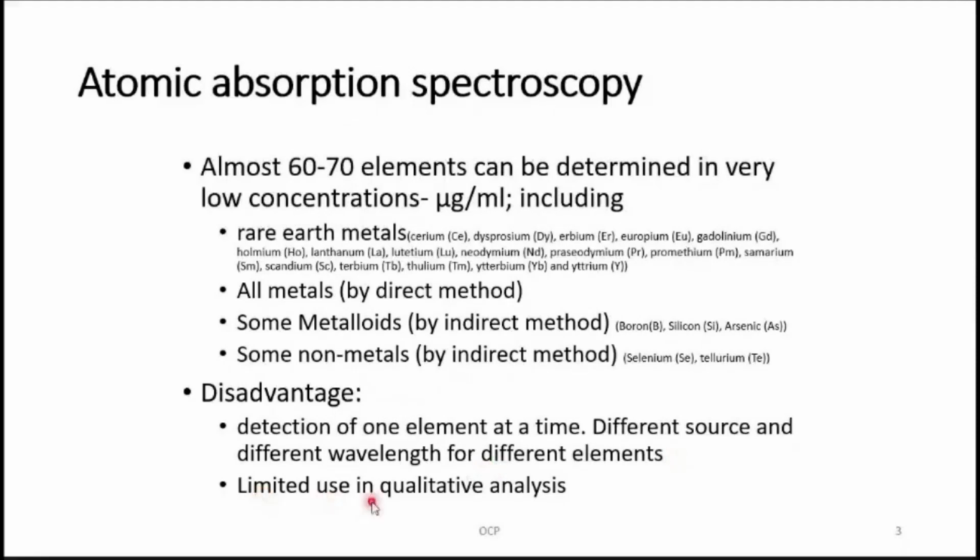It has limited use in qualitative analysis. If you don't know what you are looking for in the sample, it will be extremely difficult to determine which metal is present in the sample. But it has some applications in qualitative analysis also.